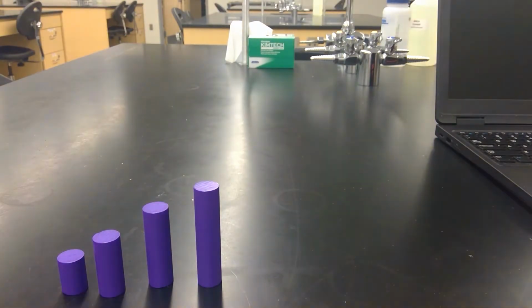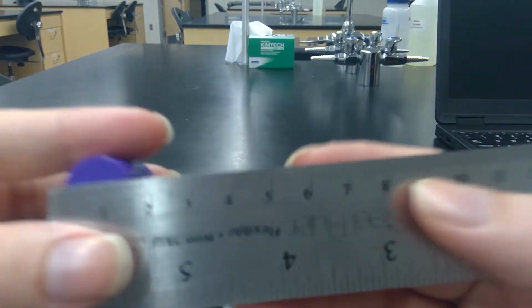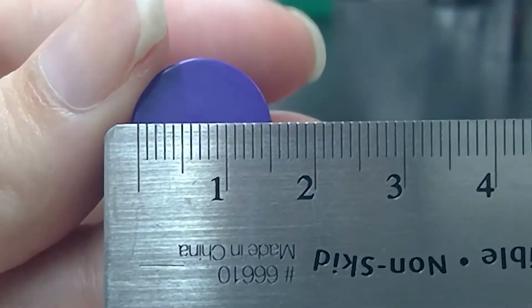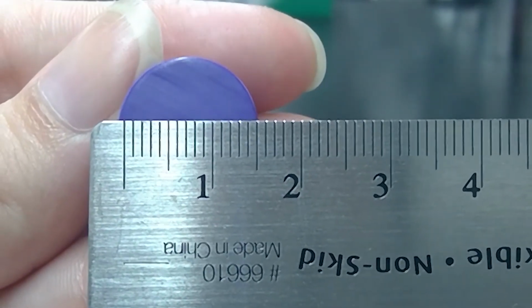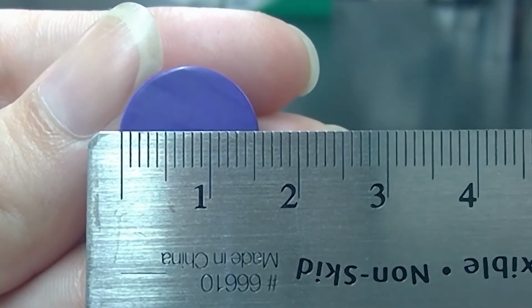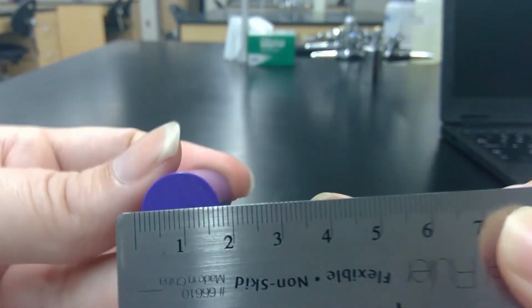So we just measured the length of each cylinder, and now we need to measure the diameter in centimeters. I believe these will all be the same diameter.